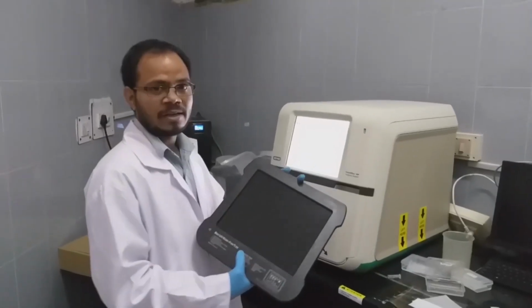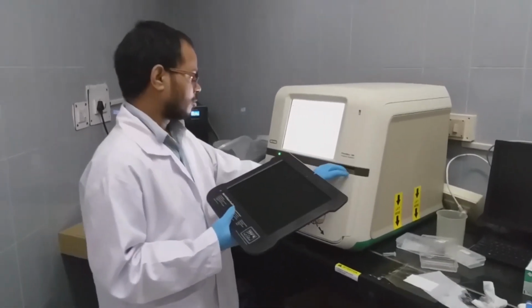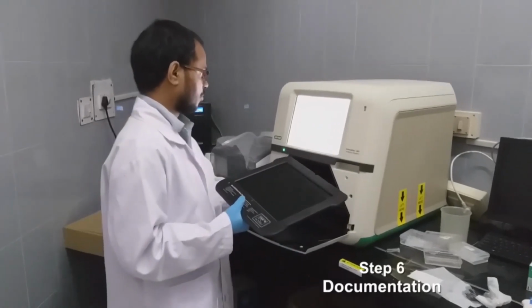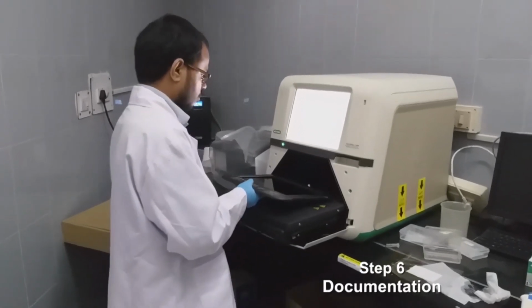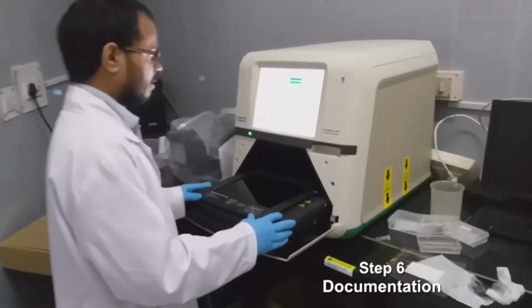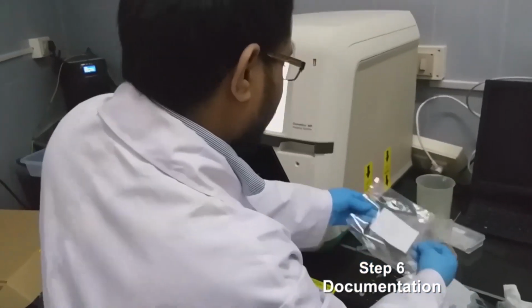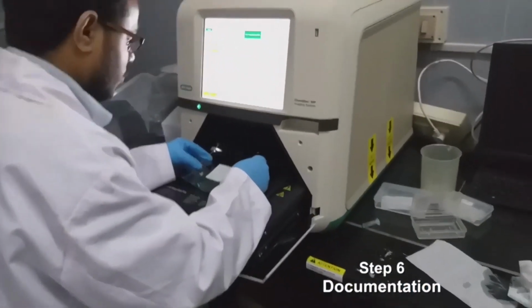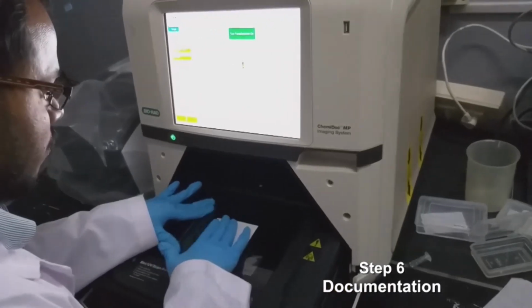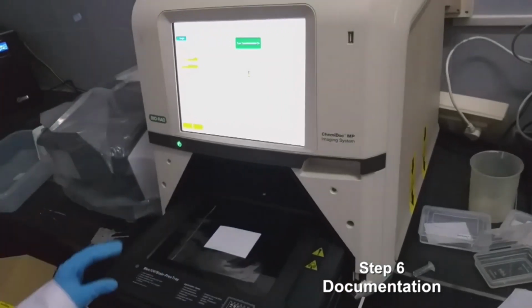This is the tray we use for developing the blot. We open the system, properly align the tray and then shift the blot to the tray.